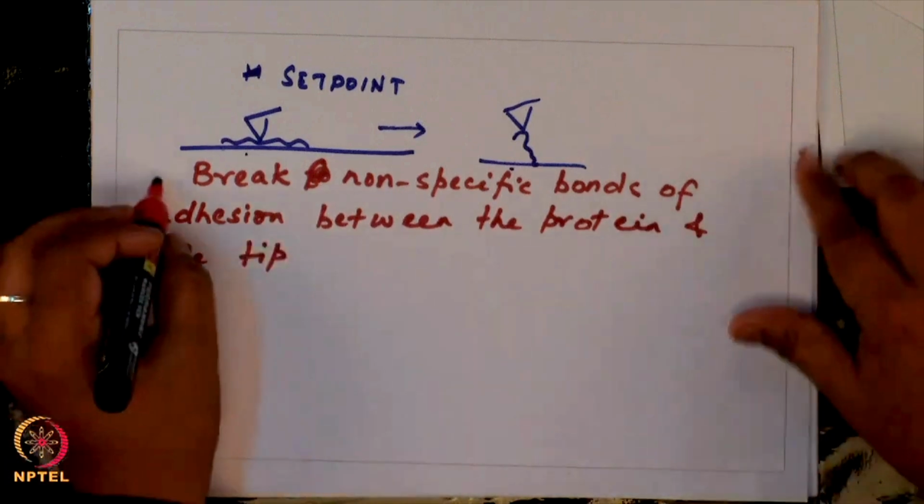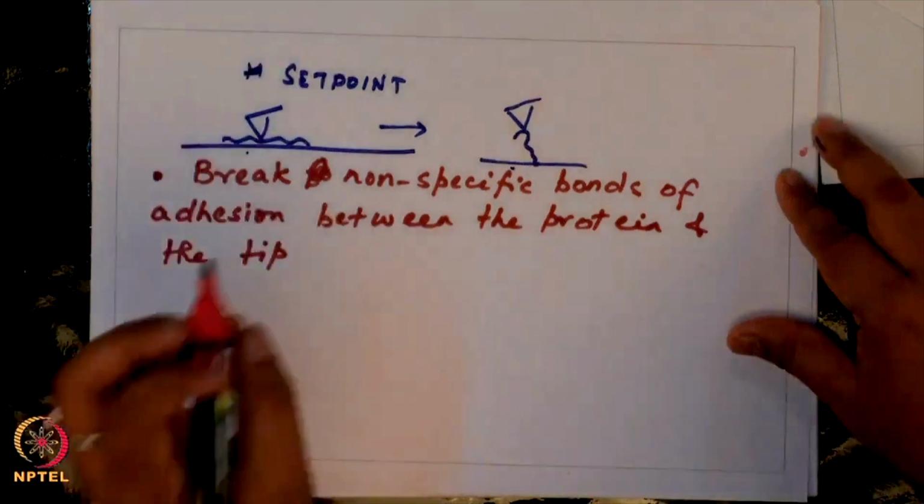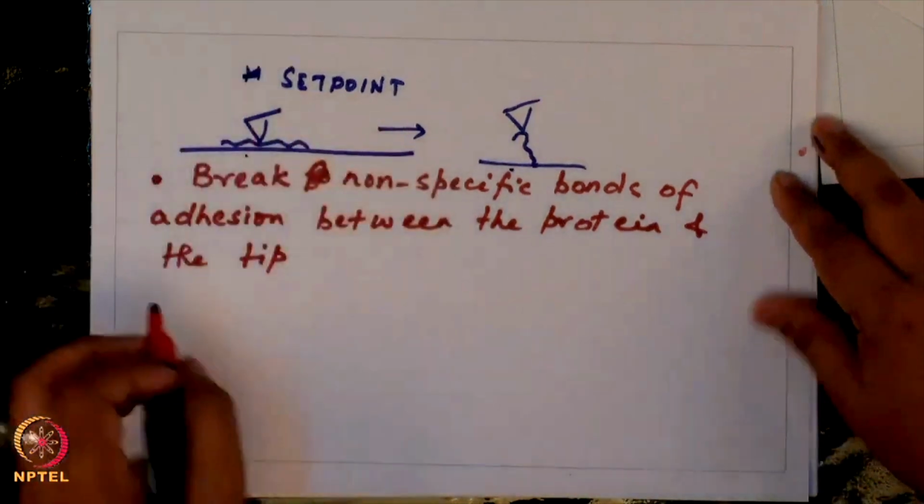So, that is point 1 when you retract. So, as you are retracting, this is step 1.